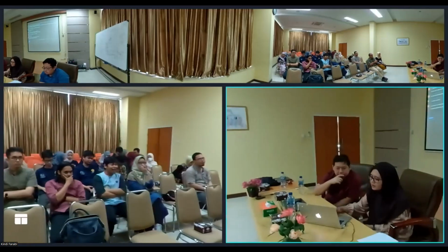Another question: what are the major possible causes of having an HRMS result different from the proposed NMR result? Okay, so there's always a challenge. Sometimes the proposed NMR result, when you run it with the LCMS, is slightly different. It only differs by a few masses. So you need to make sure that your sample sent for NMR is actually purified and clean, with no other compound.